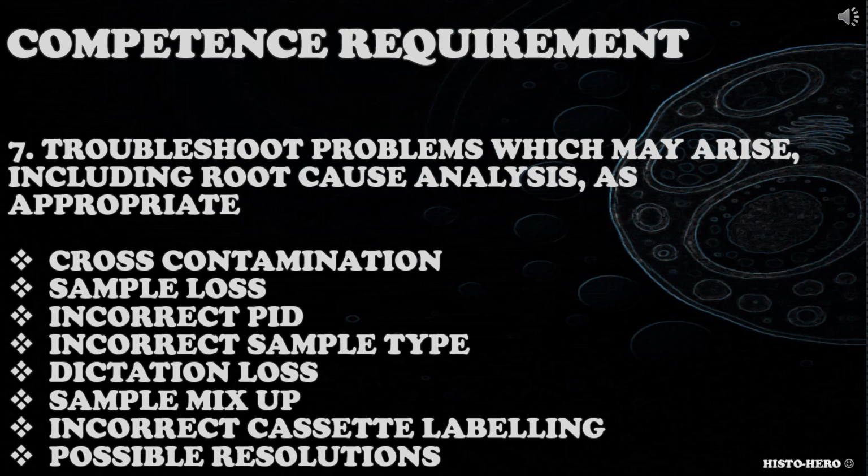When addressing this requirement, candidate could consider problems with cross-contamination, lost or missing sample, incorrect PID information, incorrect sample type, lost dictation, mix-up of samples, or incorrectly labeled cassettes. They could also consider possible resolutions of these problems.